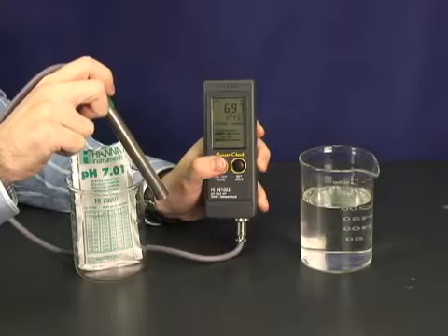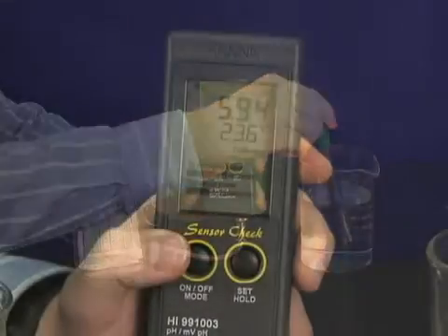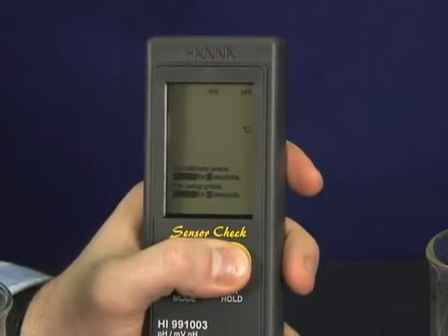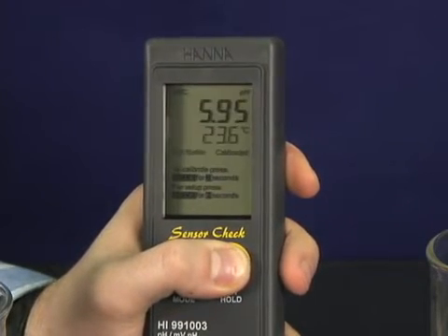Now that your meter is calibrated, just dip the electrode in the sample and you're done. The meter will give you a pH, millivolt, ORP and temperature reading instantly. Just press the set hold button to switch parameters. No changing electrodes — this meter does it all.